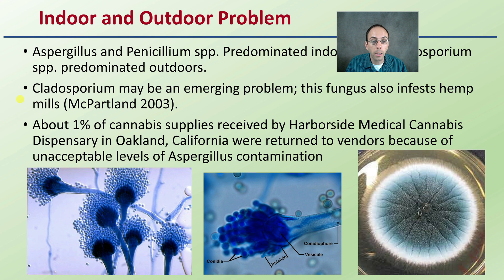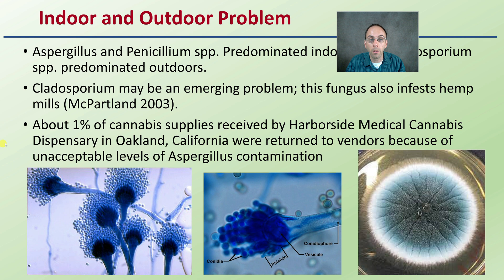About 1% of cannabis supplies received at Harborside Medical Cannabis Dispensary in Oakland, California were returned or rejected by vendors because of unacceptable levels of Aspergillus contamination. Here's what it really looks like at a zoomed-in level — conidia, these little spores that break off. It doesn't look like this on the actual cannabis plant and might be hard to see without proper microscope technology, but 1% of supplies were rejected because of just this one microbial contaminant, so it is a real problem.